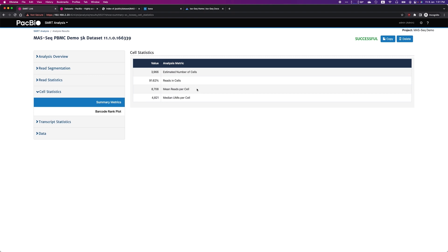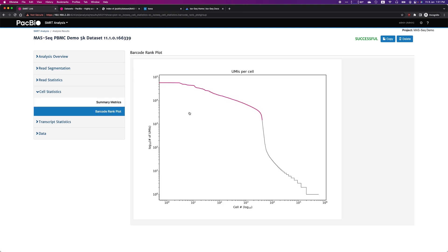Our barcode finding method works well here, but as mentioned, there is an alternative percentile method for the small number of cases where you are unable to estimate the correct number of cells. The barcode rank plot will help you to visualize how well the barcode finding method did, comparing the real cells with the background ambient RNAs.